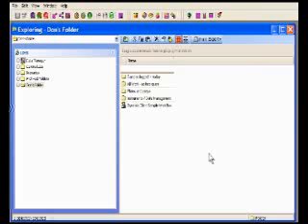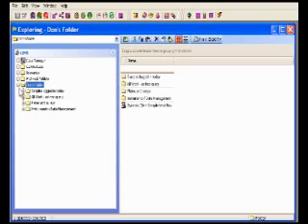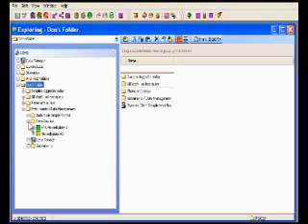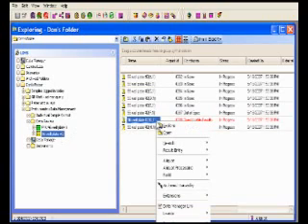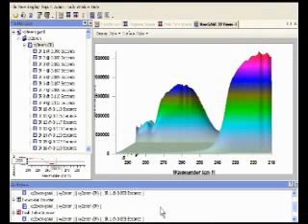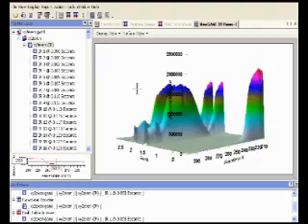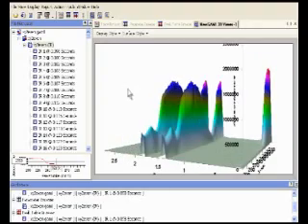Nautilus allows data and work to be organized so users can easily access data, perform daily tasks, collaborate, and make informed decisions on their workflow process. This shows a user opening a plate of samples, easily identifying the questionable data, and directly accessing the raw data to ensure its validity.